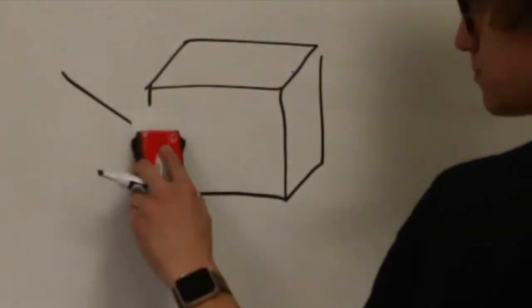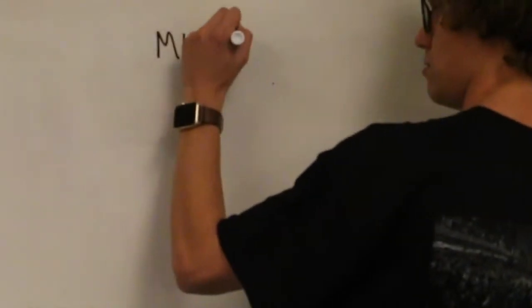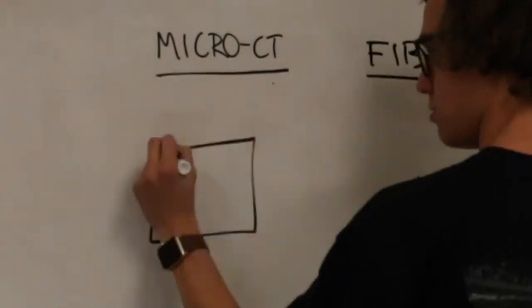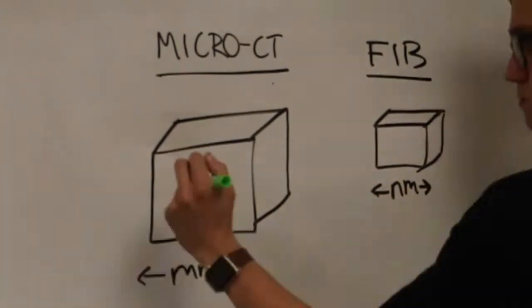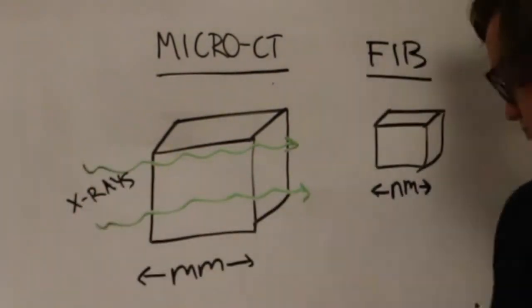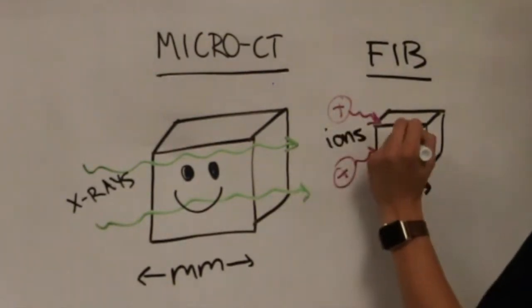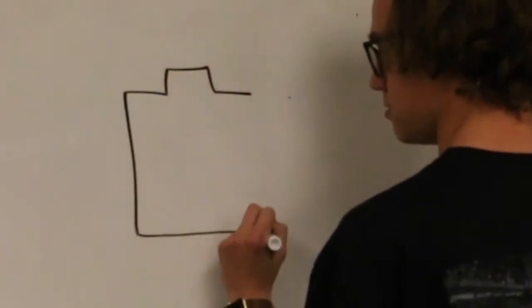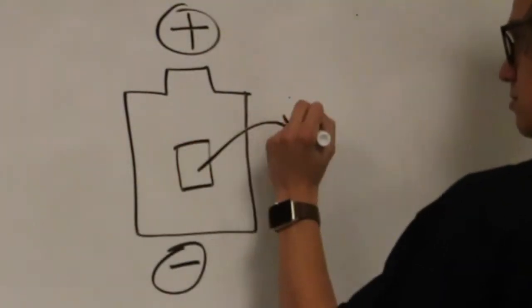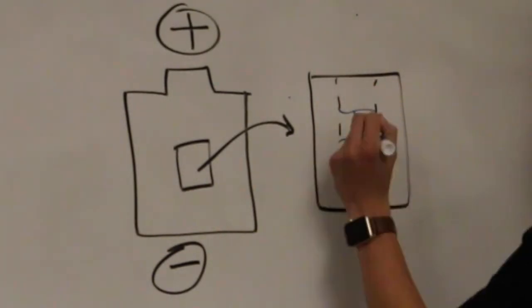Use micro-CT when you're not interested in the surface of the sample, just the inside. Focused ion beam, or FIB, is another technique to do 3D reconstructions of samples. Micro-CT is a better choice for analyzing larger samples with lesser detail. Micro-CT is non-destructive, while FIB destroys the samples as it is imaged. Micro-CT can be used to image things in 4D, meaning imaging in 3D at various times to see sample evolution, which is useful for imaging dendrites in batteries.